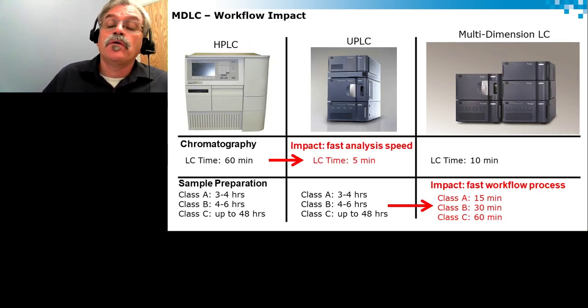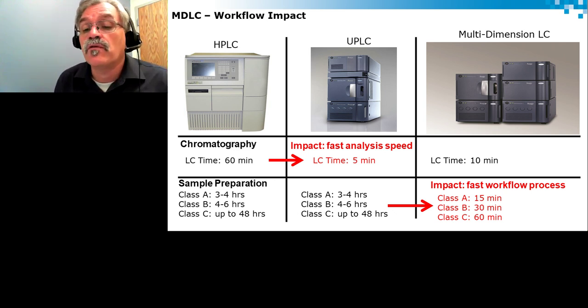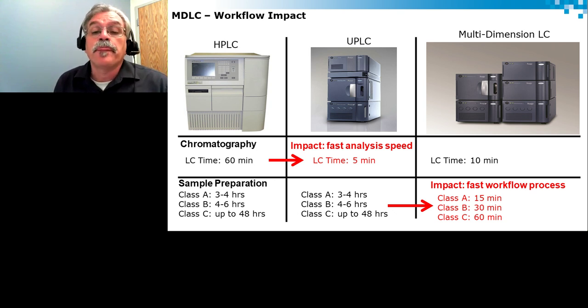In multi-D chromatography, there is a major impact that we can now start looking into really closely. When UPLC, or ultra high performance chromatography, came in the mid 2000s, it basically changed how one would do HPLC. Hour-long methods were replaced by 5 to 10 minute applications.